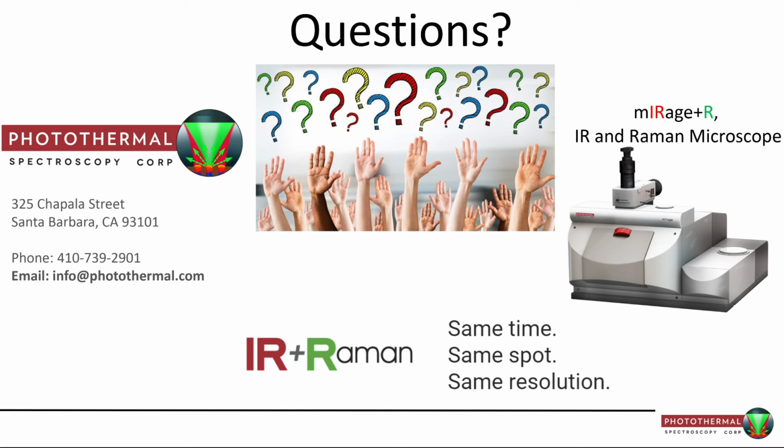Okay, the next question, actually this one's probably more for me. How does O-PTIR not suffer from fluorescence if you use a Raman laser? And this is actually a pretty common question. It's kind of an obvious question. We talk about how we use a Raman grade laser to measure the IR signal, but on the one hand, those sorts of lasers can generate a lot of fluorescence. And sure, even on our fluorescence channel, you still can get fluorescence if it's there in the sample.